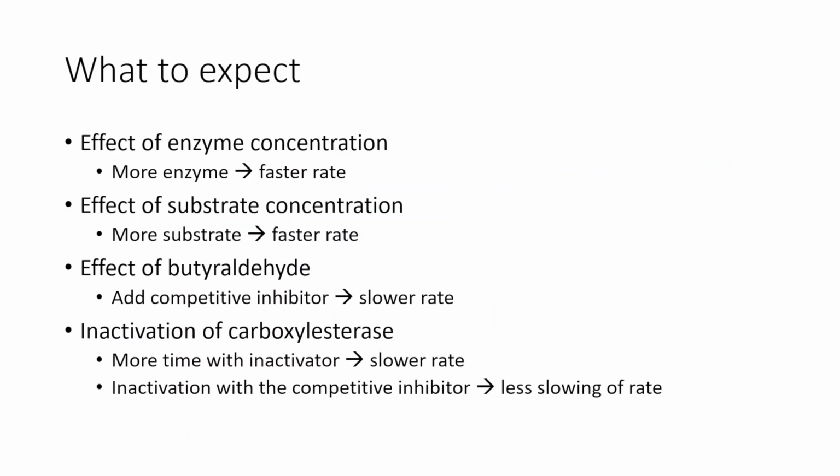So overall, what you should expect to see during this lab are these four different components that we're measuring. First, the effect of enzyme concentration. When you add more enzyme, you should expect a faster reaction rate because there's more enzyme there in your cuvette catalyzing the reaction.